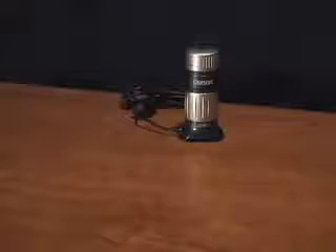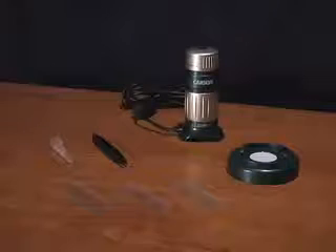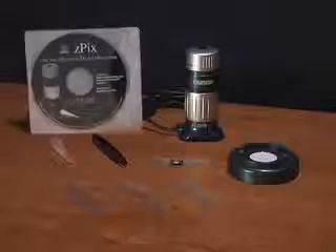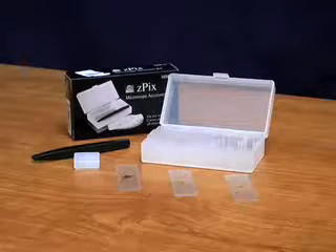Both models come with a digital microscope, a specimen base, forceps, an eyedropper, three blank slides, one prepared slide, and a CD-ROM software. For more options, try the Z-Pix Microscope Accessory Kit.